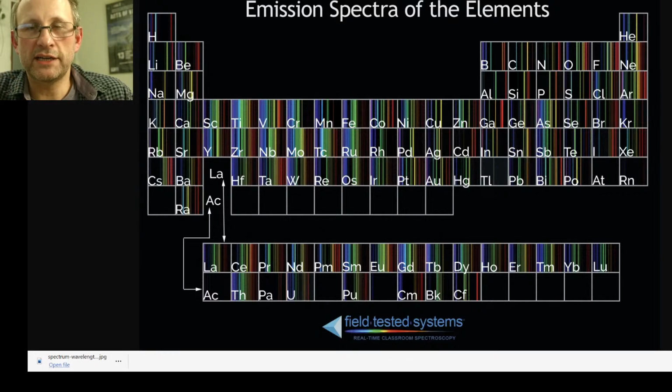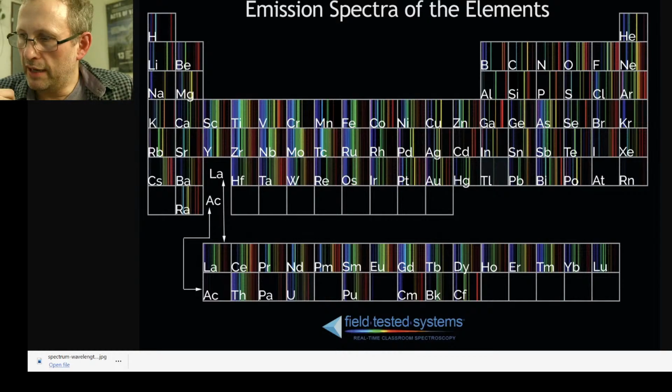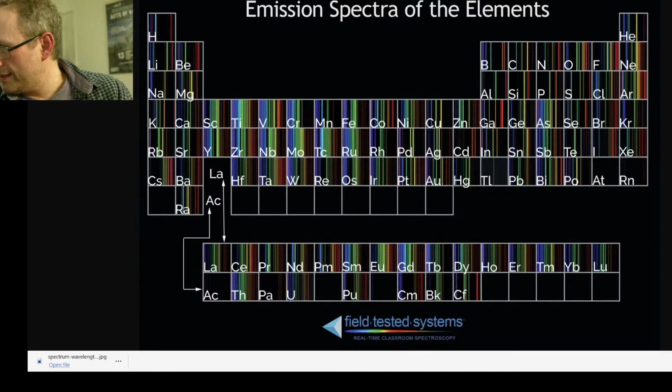We might be starting with a range of elements, and you have seen us use tungsten, indium, and brass, which contains lead and copper and zinc and so forth. A range of elements are in there, so there's more potential for other elements to be synthesized that could produce specific spectral lines. So that's what we're looking at there.